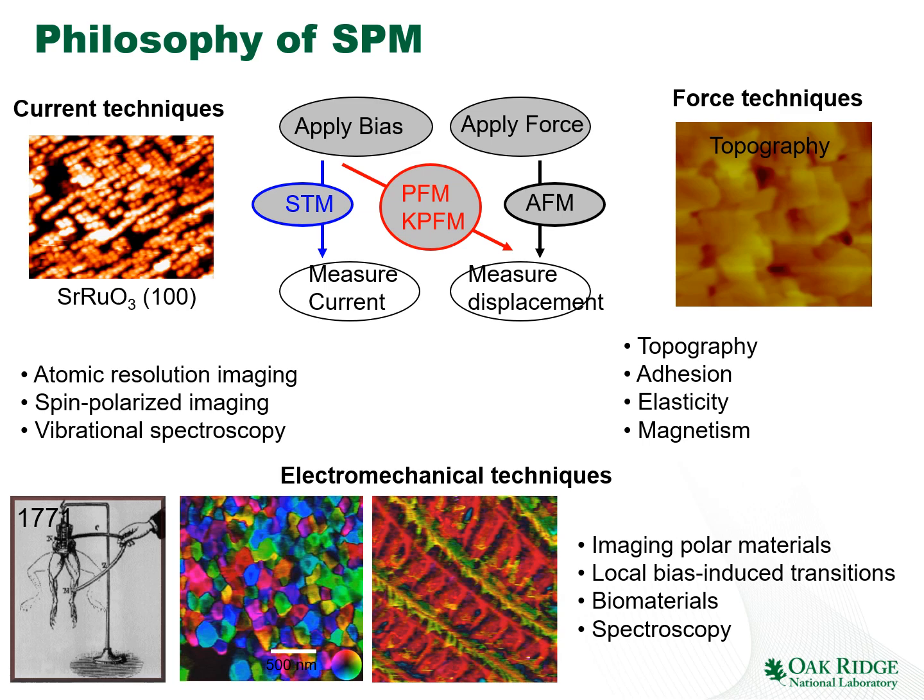Now, one last point that I want to make in this lecture is the philosophy of SPM. In other words, if you are familiar with the classical scanning probe microscopy techniques such as AFM or STM, atomic force microscopy and scanning tunneling microscopy, the question is, how is PFM related to them? And the answer is that interestingly it is complementary to these techniques in terms of mechanism.